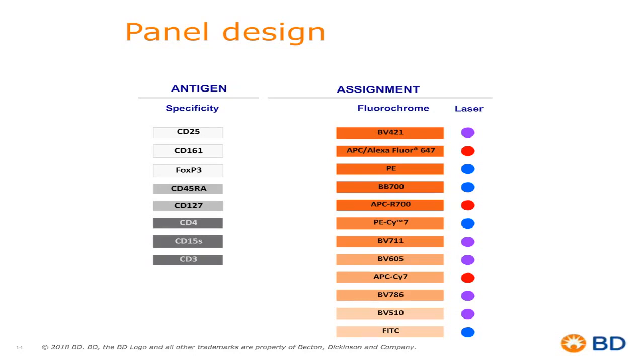Where we got that fluorochrome brightness, I'll talk about shortly, but in general, just think about this, that BV421 is my brightest fluorochrome on my specific instrument, and FITC and BV510 are going to be my dimmer fluorochromes. So I want to save some tandem fluorochromes for drop-ins.